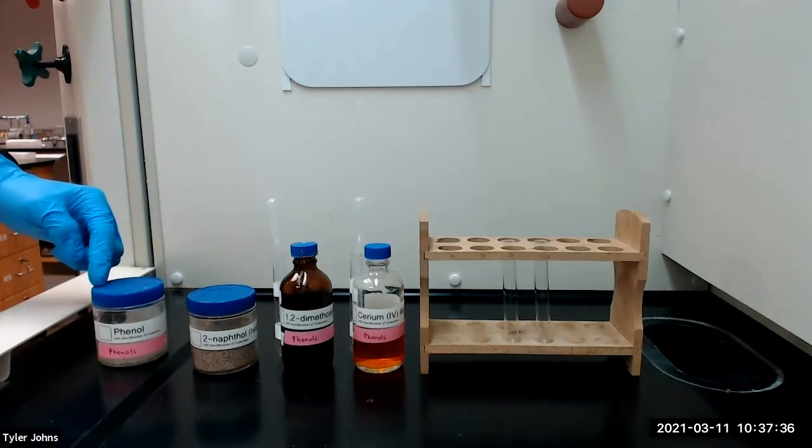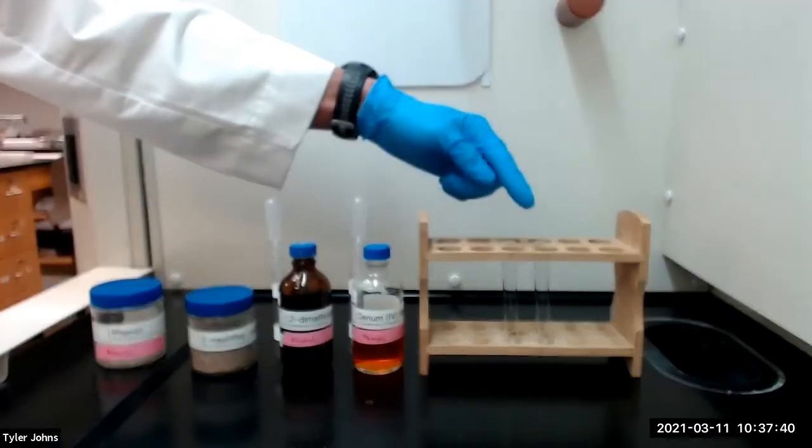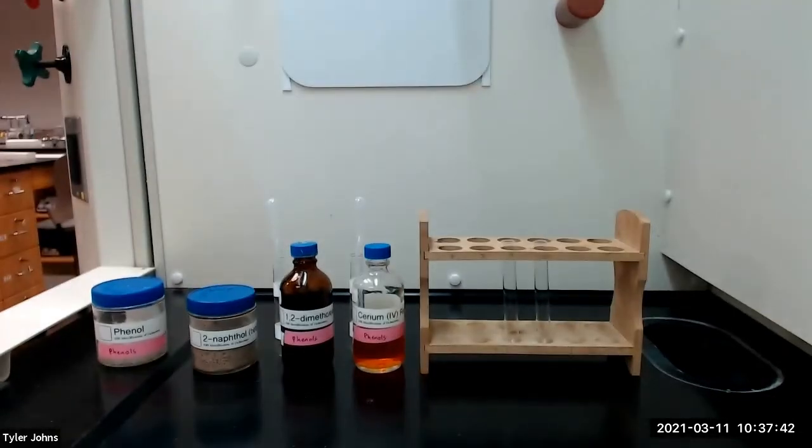We will then add a small amount of each of our test compounds to the solution in the test tubes and stir with a micro spatula. The unsubstituted phenol forms a dark brown precipitate and other phenols should yield a deep red solution.